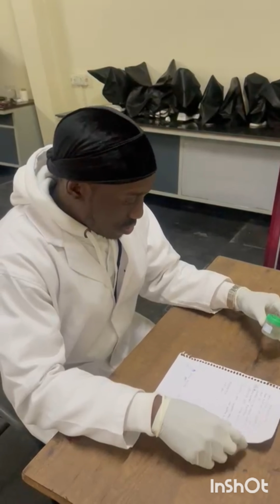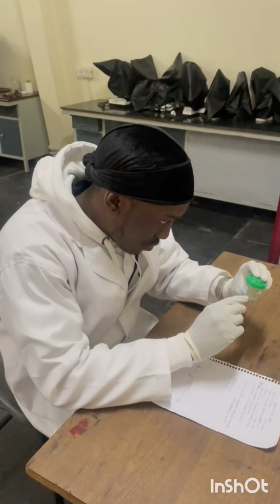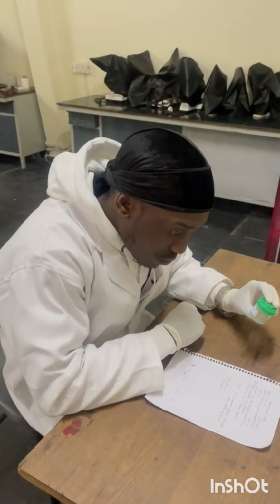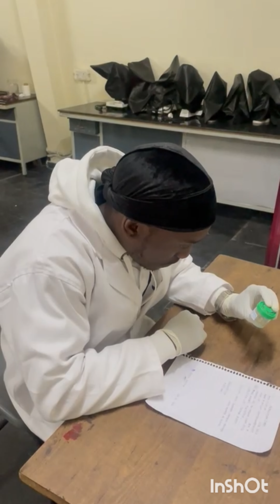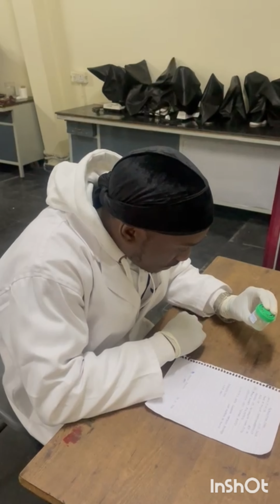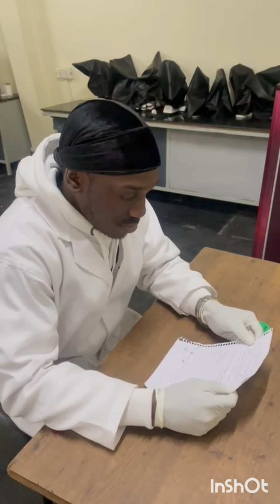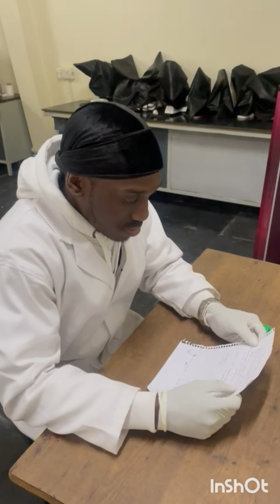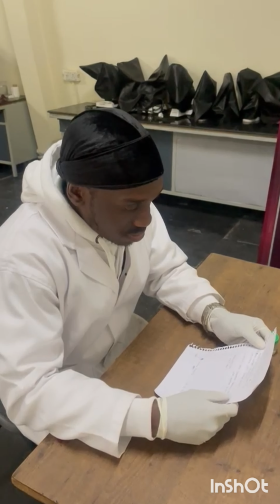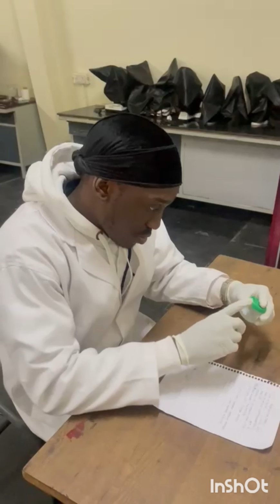So I'm just going to go over the best practices for proper sample reception again. 1. Verify patient identification. 2. Check specimen type and quality. 3. Documentation. 4. Prioritize samples. 5. Train laboratory staff. By emphasizing the importance of proper sample reception and implementing best practices, histopathology laboratories can minimize errors, ensure accurate diagnosis, and maintain patient safety and trust.